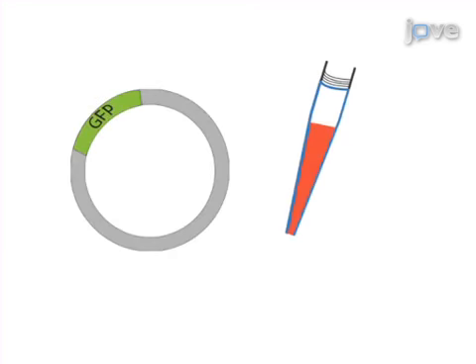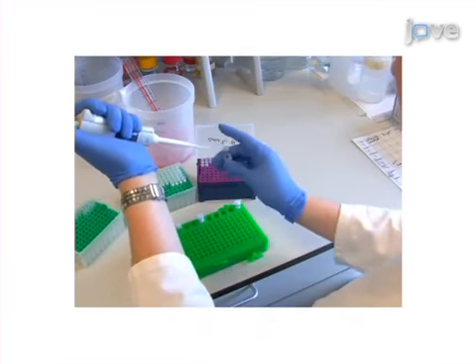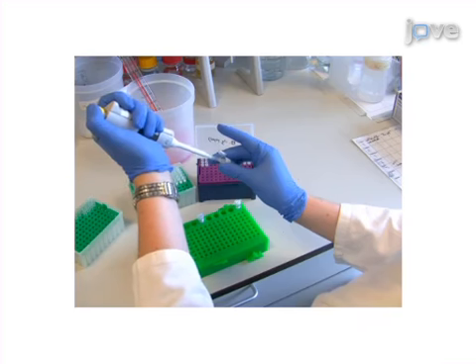The second step is to transfect plasmids encoding a protein of interest or a control plasmid into the labeled cells. Next, the cells are lysed and samples are immunoprecipitated from the lysates. Then, equal volumes of control and sample immunoprecipitates are combined and submitted for LC-MS-MS analysis.